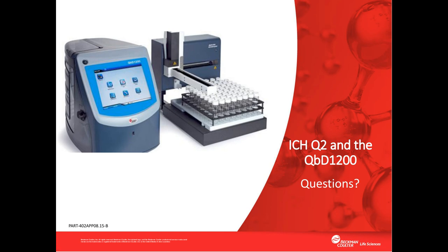Thank you, Tony. We have one more question here for you. Thank you for your presentation. It is well known that some laboratory TOC analyzers measure both inorganic carbon and total carbon using separate sensors and then use these two measurements to calculate TOC, frequently resulting in errors in the reported TOC value, even sometimes reporting negative TOC results due to sensor drift. Could you please explain how the QBD 1200 avoids these types of errors?